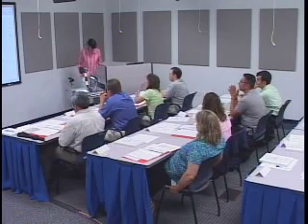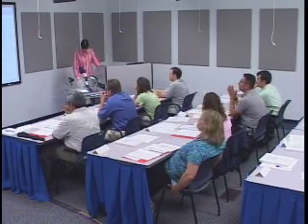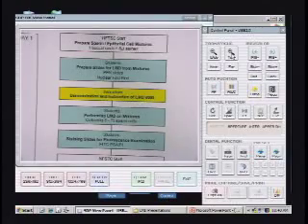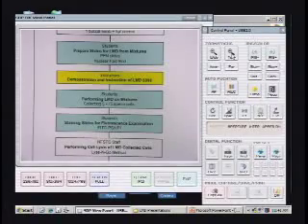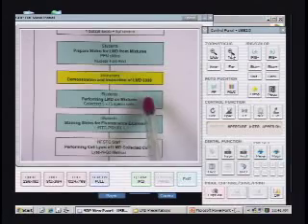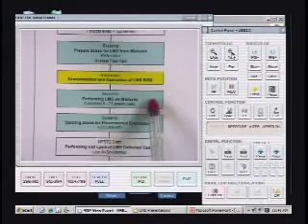So then we're going to be going into the lab shortly, and Andy Lee is first going to give what he called care and feeding of the instrument. Very short, just the basics of the instrument, and not to make it explode or anything like that, but don't worry. And then Kelly and I will break you up into smaller groups and go into more detail on how to cut samples out. Then you will be collecting sperm samples, and we'll break you up into smaller groups to do that. You'll be switching off. You'll be performing LMD on some of the mixture slides.